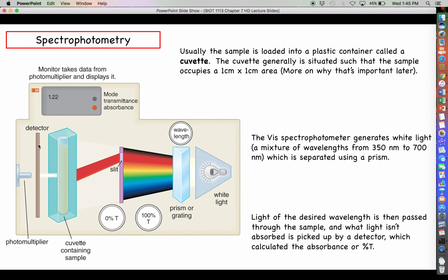By its wavelength. So importantly, the general idea is that the shorter the wavelength is, the more energy that particular type of radiation has. So if you look at the chart here, in which we start with the visible spectrum, which is in the 350 to 700 nanometer range, as we get even shorter and shorter wavelengths into the femtometers and so on, we're going to start talking about things like gamma rays, X-rays, UV rays, things that you probably know just from looking at those.